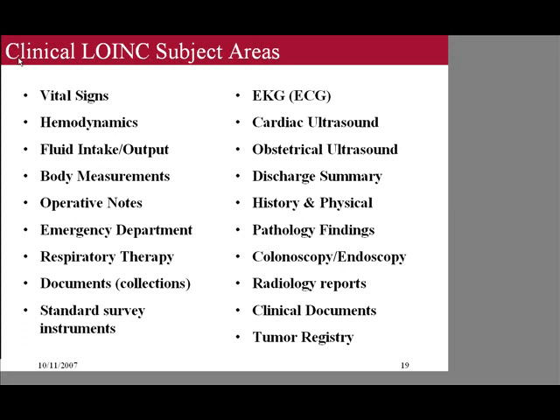As Huff has pointed out, laboratory LOINC is fairly self-defined or focused. Clinical LOINC, though we haven't created as many codes yet, is essentially everything else that you want to say about a patient that isn't laboratory. So in essence, the universe is bigger for clinical LOINC than lab LOINC, but we haven't populated as much of that universe yet with codes.